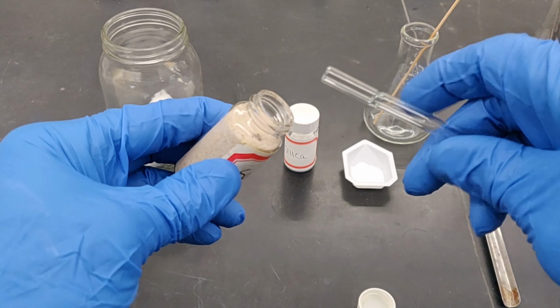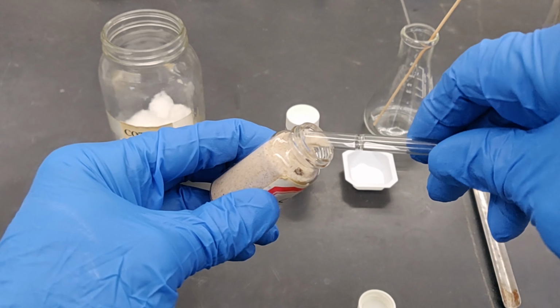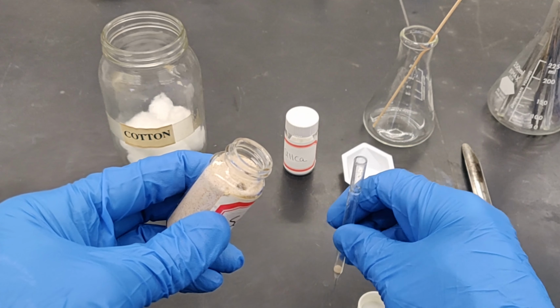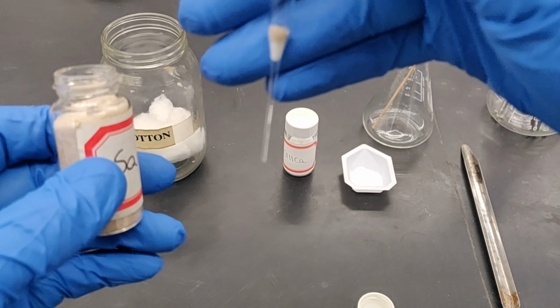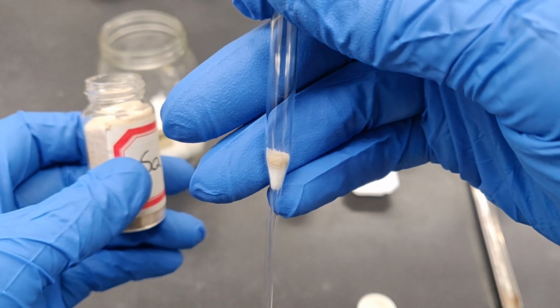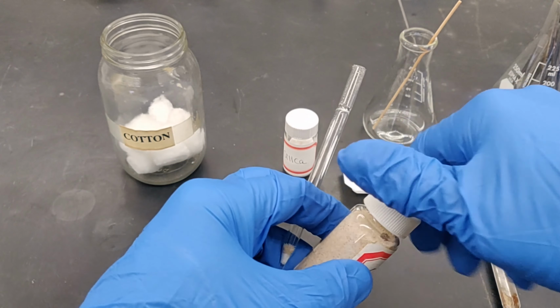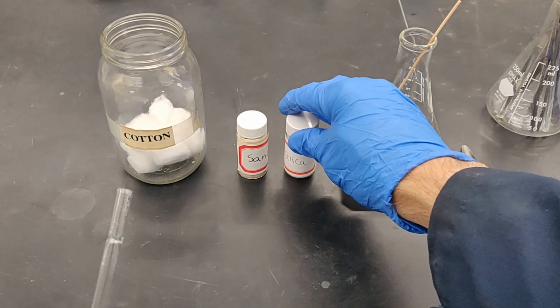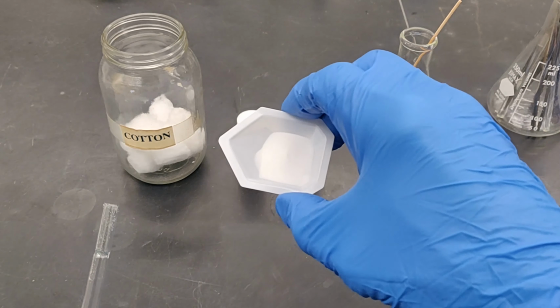Above the cotton, add a very small layer of sand. Above the sand, add approximately 0.75 grams of silica gel.